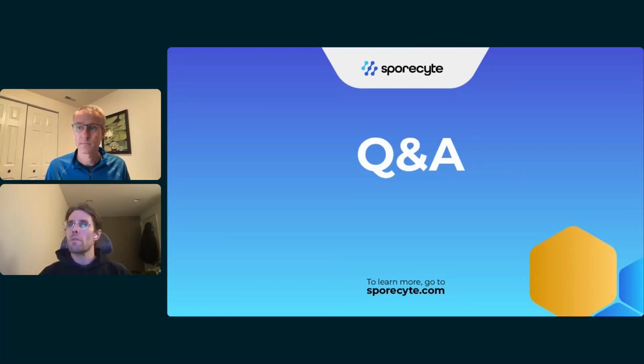Yeah, that was great. We have time for one more question, so I'll answer this one briefly from Benjamin. Will you use this AI to branch out to other areas like asbestos? Is that possible? It certainly would be possible. Anything where a human is looking through a microscope and using human judgment or training to identify objects, and this goes beyond microscopy as well, there certainly could be a way to adapt an algorithm like ours, which we use here for air quality, to identify that. There's a lot of other things that go into it beyond just whether the AI can do it, to determine what sort of test we develop.